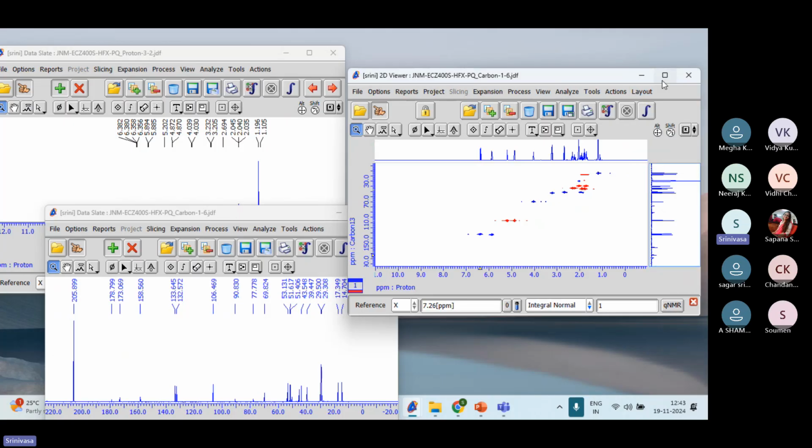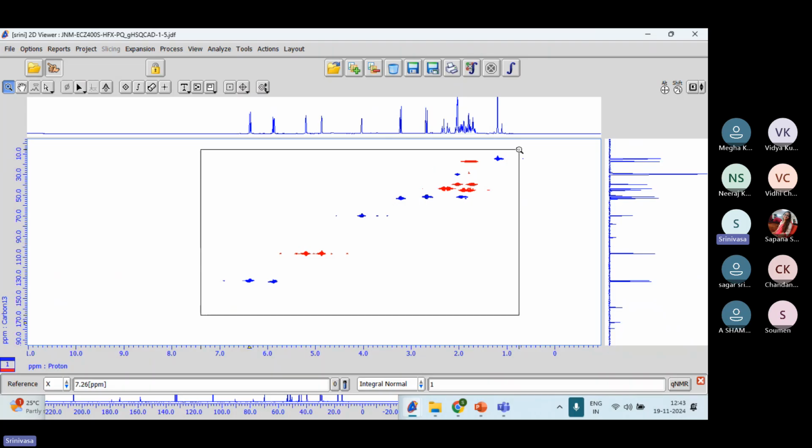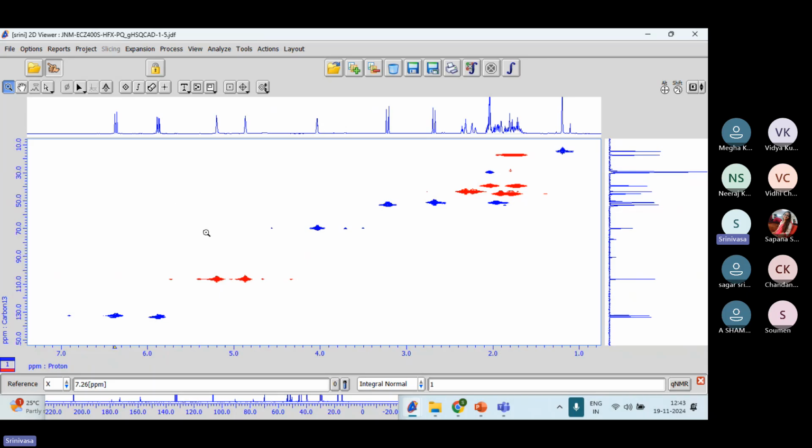Show 1D ruler is removed. So now done is done. Then you can just zoom here. There's no diagonal. You can start zoom from any spot, not the issues. Okay. So zoom. Then intensity decreasing again. Hold control and scroll button. Okay. Adjusting this scroll will become removed.